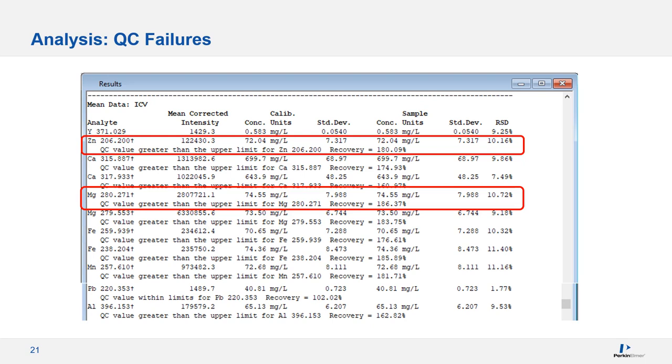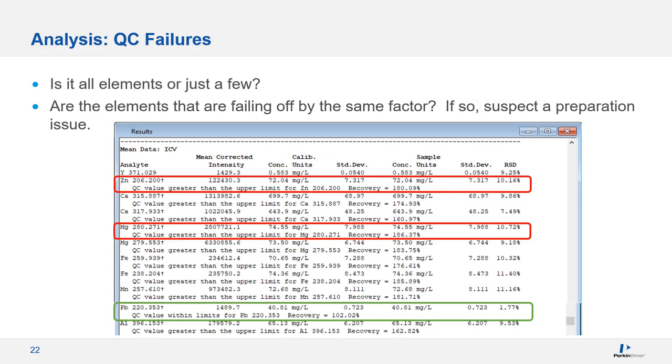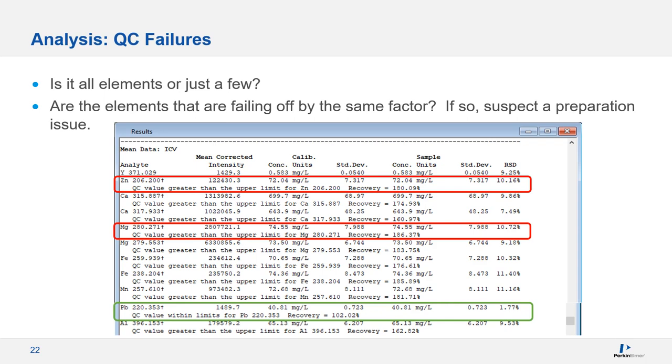Let's take a look at one particular data set as an example. When your QC fails, here are some questions to ask yourself. Is it all elements or just a few? If it's just a few, you need to give some thought as to what is different between the good elements and the bad elements. If all of the elements are off and by the same factor, this is usually an indication of a sample preparation error, such as an issue with pipetting or dilution. Here you see zinc and magnesium, along with several other analytes. They're failing, but lead is fine. If lead is not added separately from the other analytes, a pipetting or dilution error is unlikely.